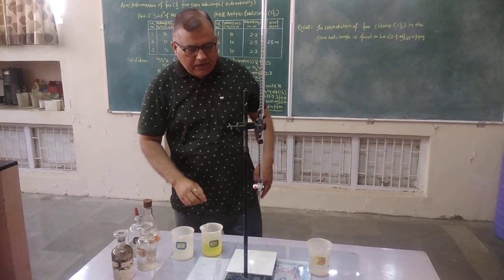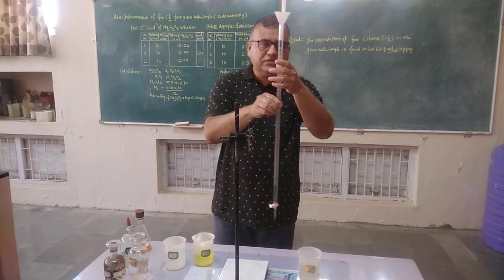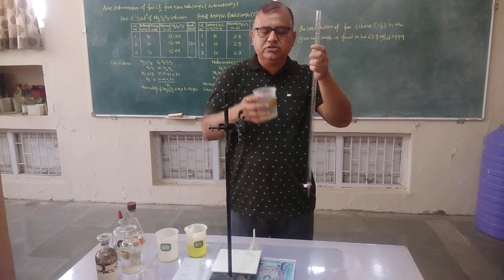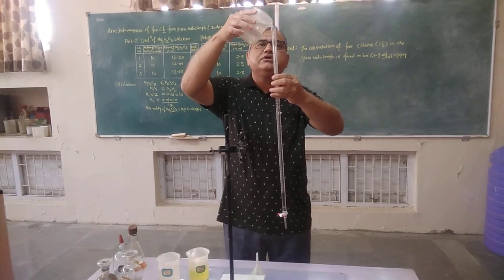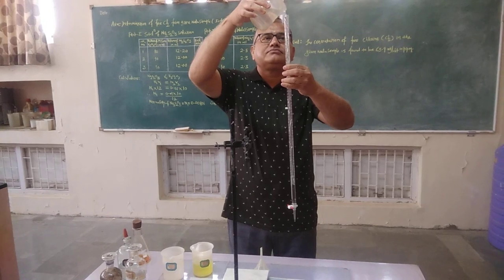During this time, you fill your burette with Na2S2O3 solution, that is sodium thiosulfate solution. Just add this solution in the burette like this.